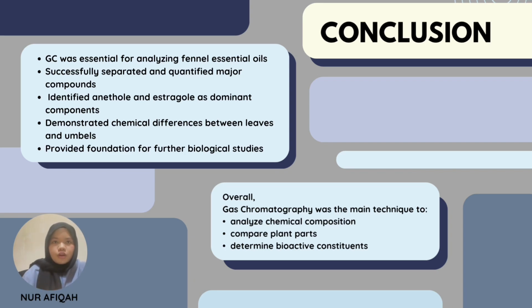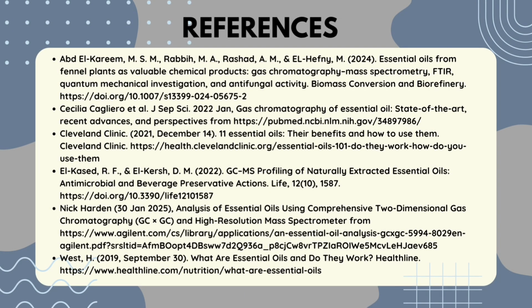Overall, gas chromatography was the main technique used to analyze chemical composition, compare different plant parts, and determine the bioactive constituents responsible for antifungal activity. This is our reference.